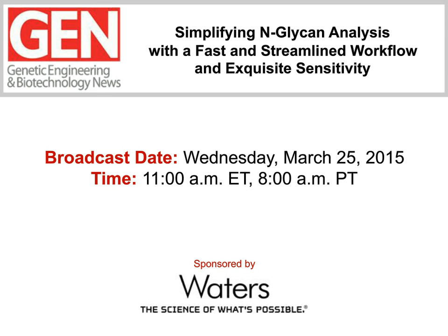Unlike proteins and other biomolecules, researchers have found glycans sometimes very tough to study. Technological advances in tools and techniques for improved glycan analysis have been few and far between. And that's the issue we're going to address during today's webinar.